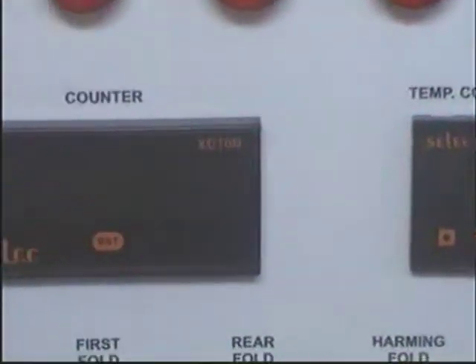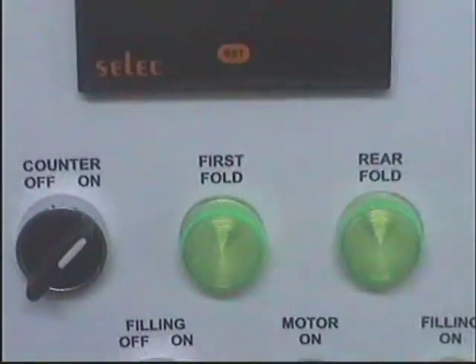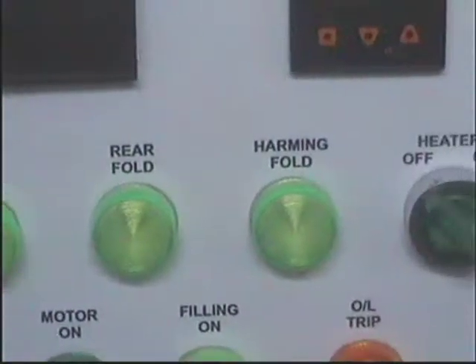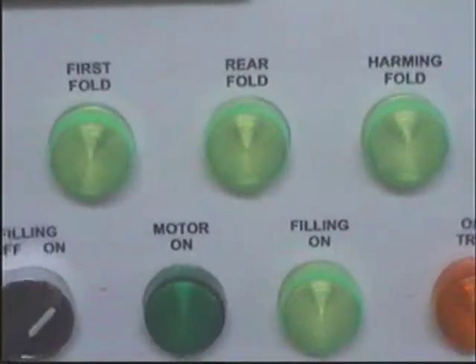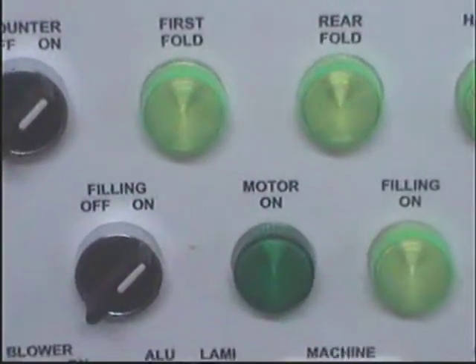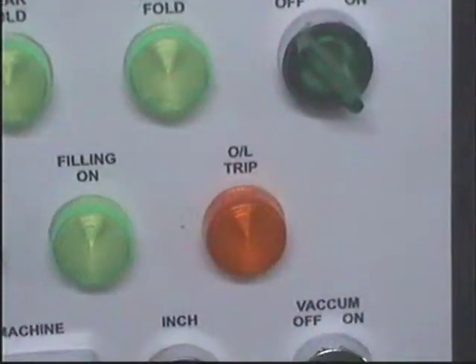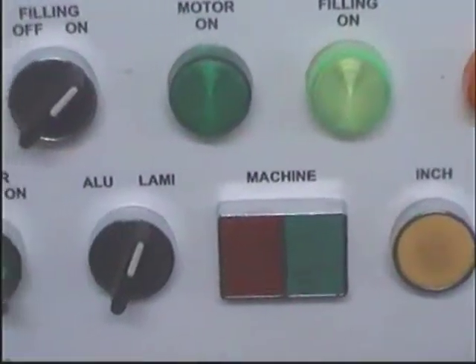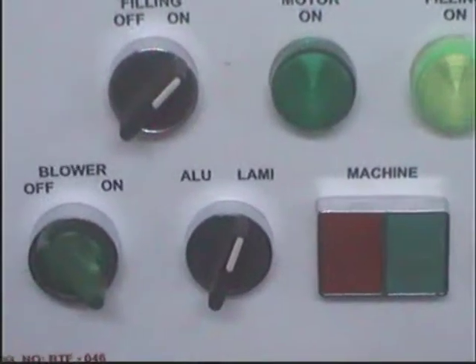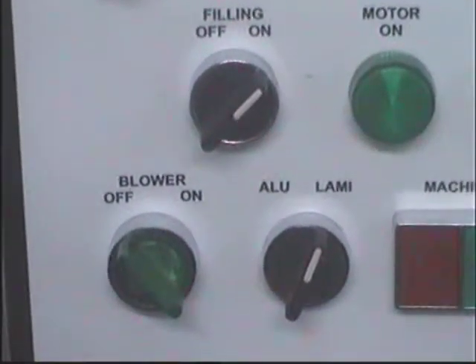The control panel features: the temperature controller, RPM counter, counter on/off, first fold, rear fold, hammering fold, heater on/off, filling on/off, motor on, filling on, overload trip, vacuum on/off, inching, start/stop button, aluminum/lamy selection, and blower on/off. This is the pressure indicator given.